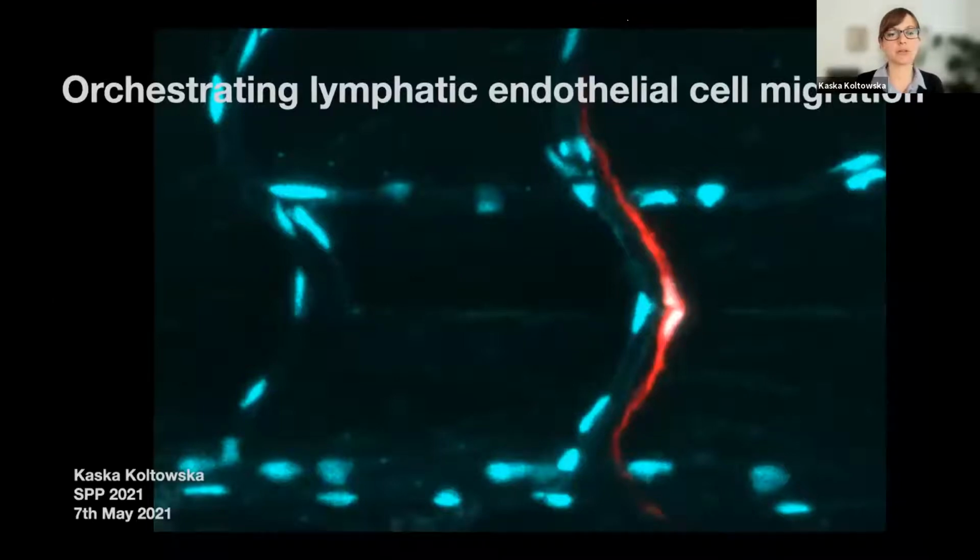So I will switch gears from physiology to developmental biology, as I am a developmental biologist at heart, and we are very much interested in how lymphatic vessels form. And we use zebrafish as a model system to study this question. And what we have been doing is utilizing a lot of live imaging to try to understand the dynamics of the developing lymphatic vessels.